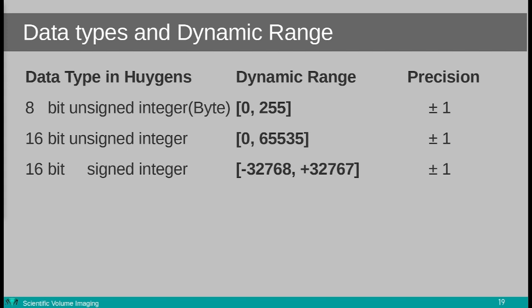Note that so far we've only mentioned operations on images dealing with whole numbers. However, deconvolution requires the use of a PSF image.